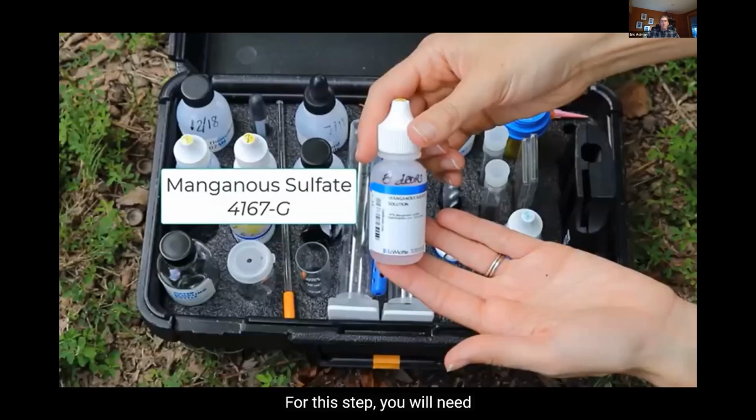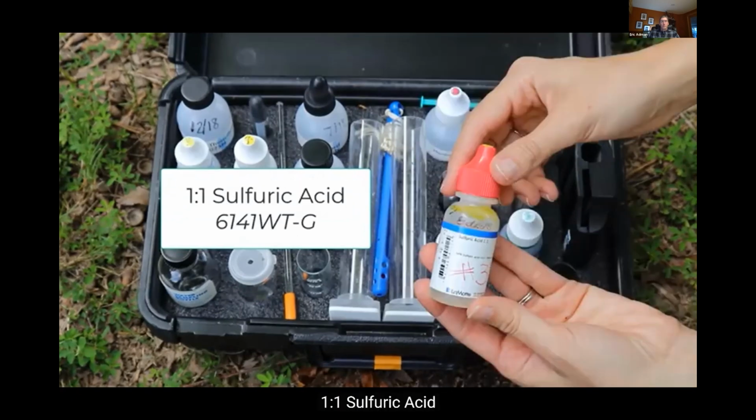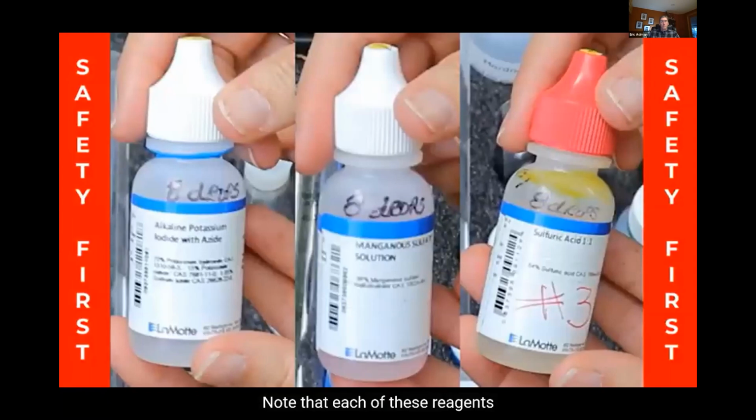For this step, you will need manganese sulfate, code 4167-G, alkaline potassium iodide azide, code 7166/G, 1:1 sulfuric acid, code 6141-WT/G. Note that each of these reagents are considered hazardous substances.